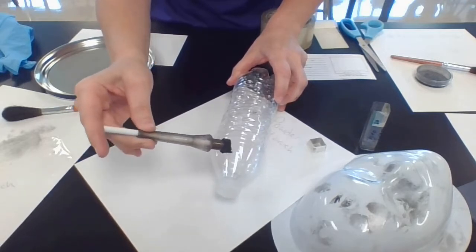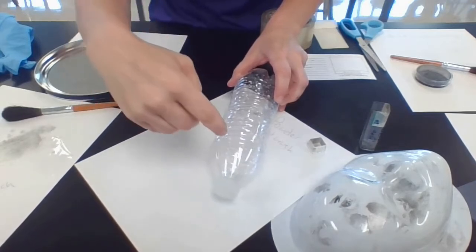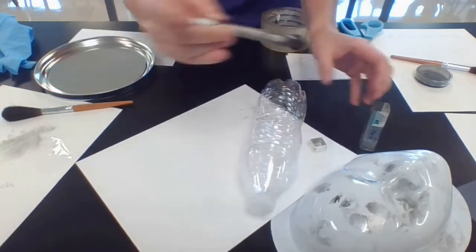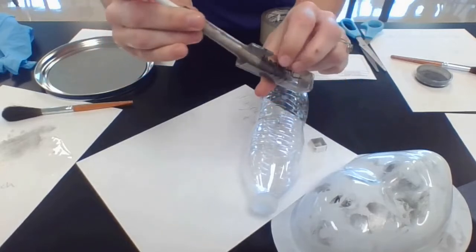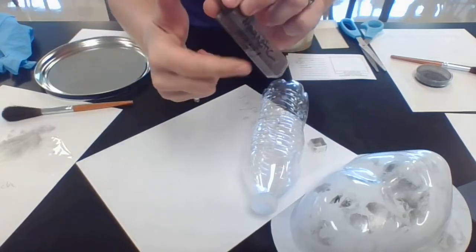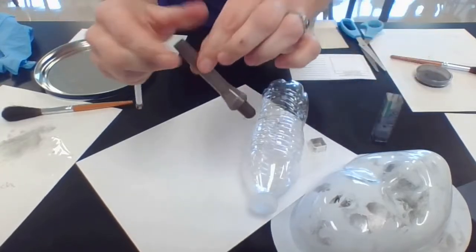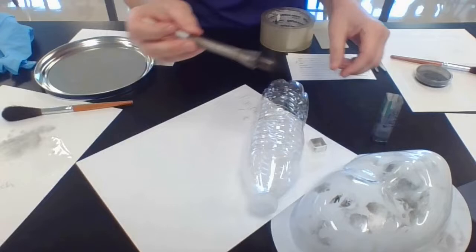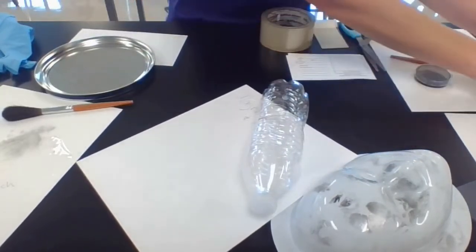I would probably use a bit more powder than I have here, but you can start seeing it slowly coming about. It may be difficult to see in the camera. To release the magnetic powder, you simply return it back to the vial and then pull up on the magnet portion, which allows the powder to drop back down. It's a fairly easy cleanup — just reinsert the magnetic wand and you're ready for the next piece of evidence. That's the dusting part using magnetic powder.